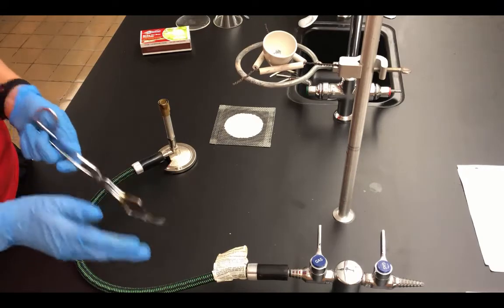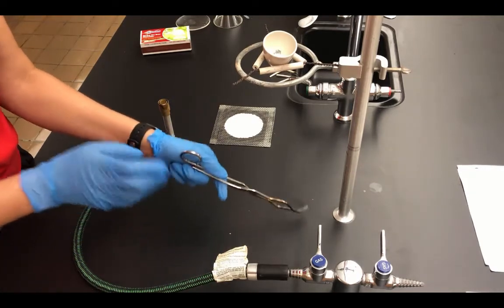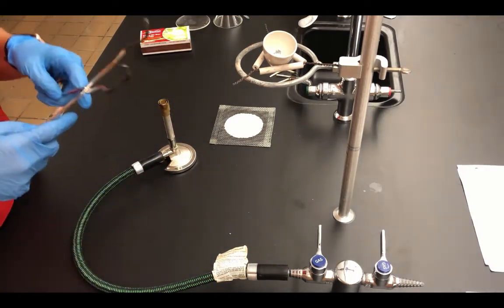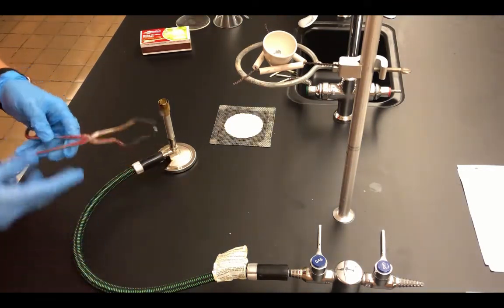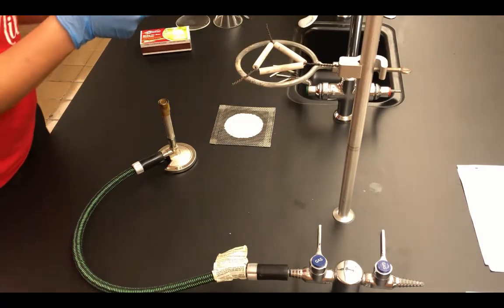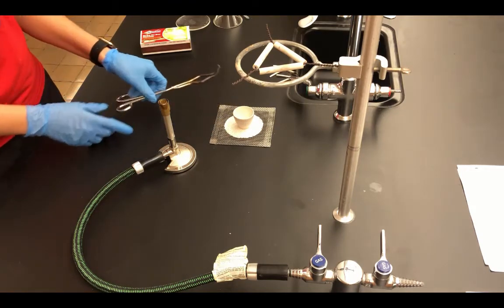And we can record as an observation that some of the substance was kind of popping out of the crucible, so that could be a potential source of error. So whenever you notice that something like this is happening, you want to record that in your lab notebook, just so that when you are trying to determine sources of error, you can look back and see if there was anything that you wrote down that could attribute to error in the lab.